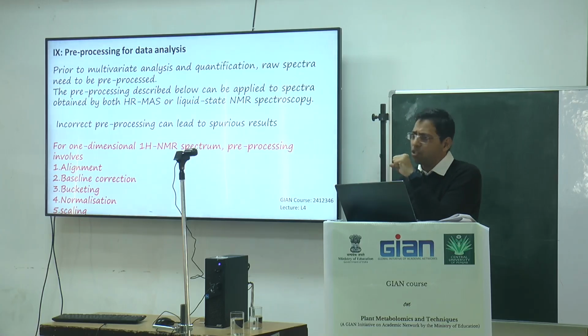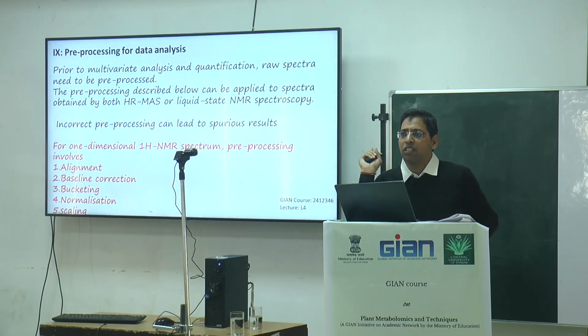Now the question comes up that you can only analyze if you have curated data. You can say this is dark, this is light, this is the height you measured; only then can you say some are large and some are small, and some skin colors are fair and some are dark, because you observed that. So whatever pattern you have received in the NMR, you have to do the pre-processing before the data analysis. Data analysis you can only do when you have pre-processed these steps.